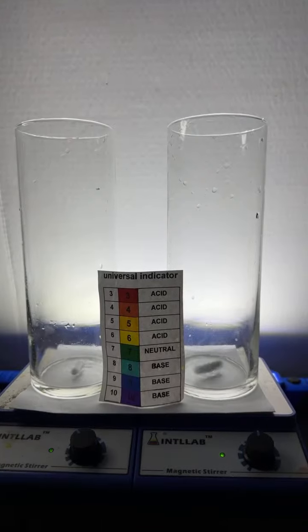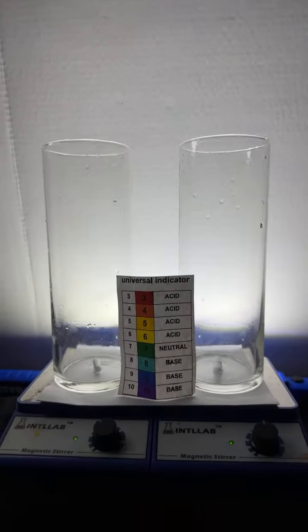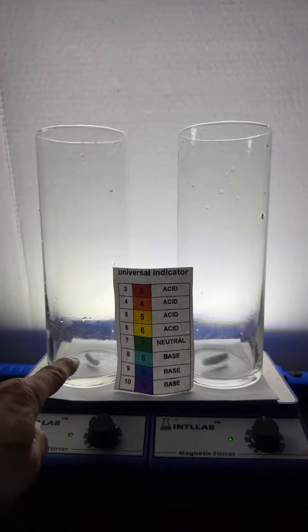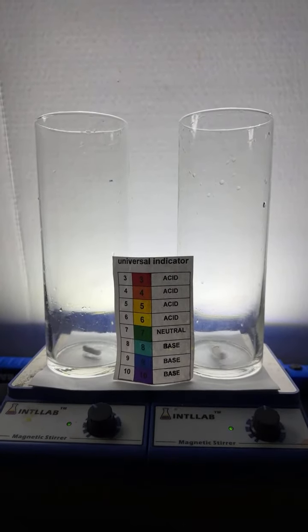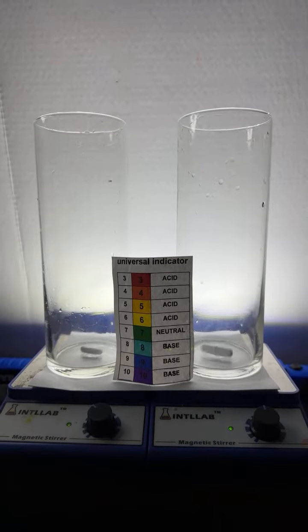All right, let's do some experiments, shall we? Come on, baby. I got my stir bars going. This one doesn't look like it's spinning, does it? That's because the rate at which it's spinning is almost identical to the frame rate that the camera is operating at. Let's pour some water in these flasks to get our experiments going.